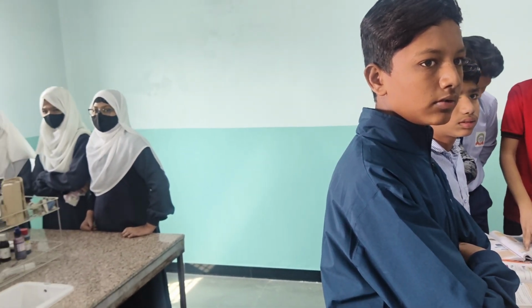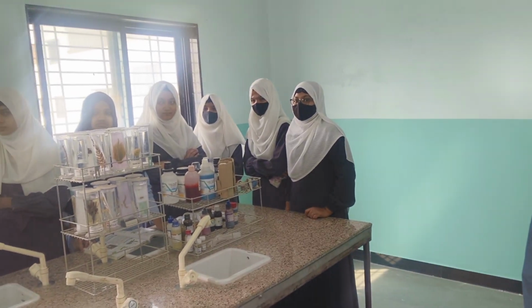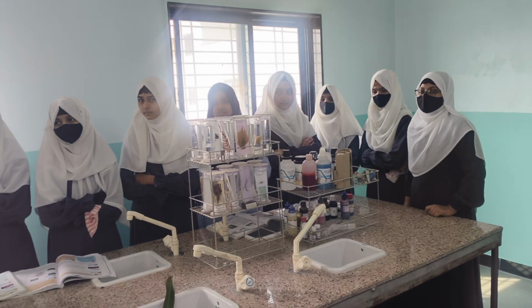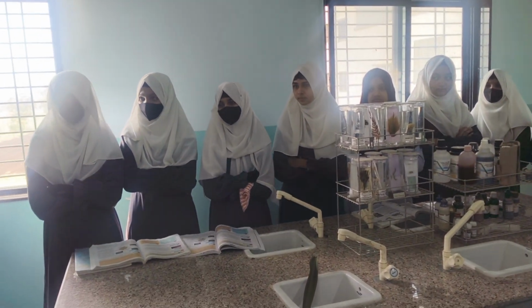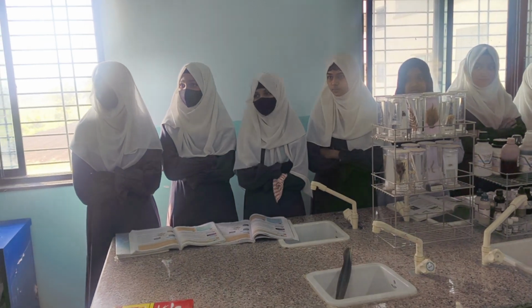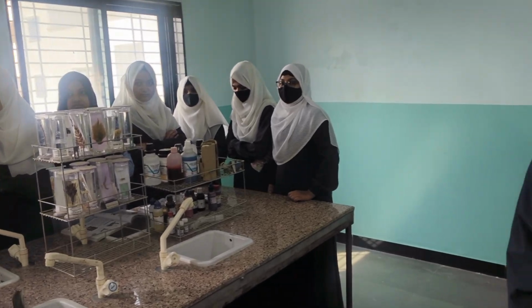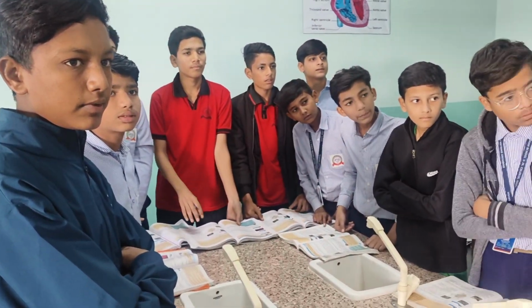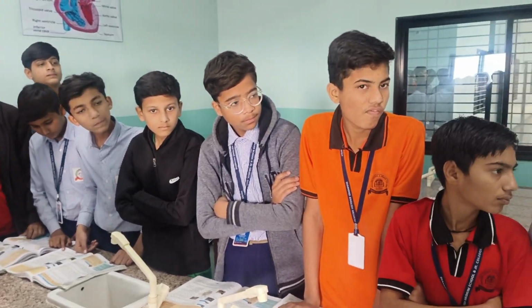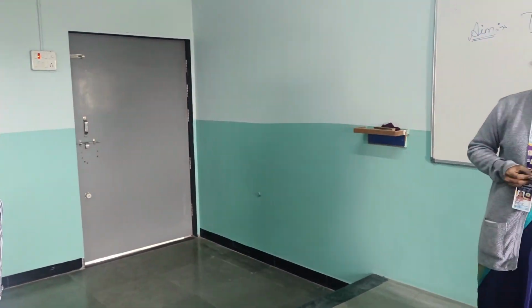So what will we see? We will see lactobacilli present in curd. And how can we see these lactobacilli? These lactobacilli are rod-shaped structures and blue in color, because they take the color of methylene blue, which is violet. Due to the methylene blue, the lactobacilli are purple or blue in color. Okay, so how will we perform this practical? Let us see with the help of the practical.